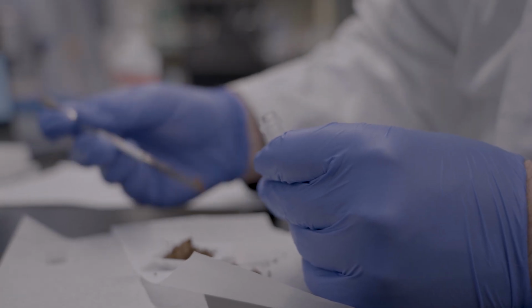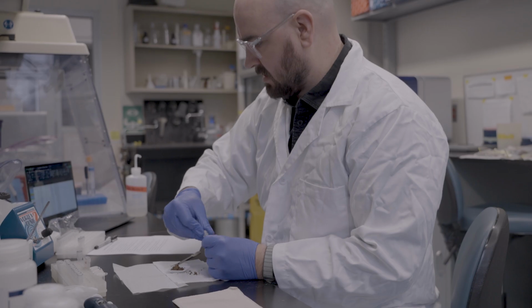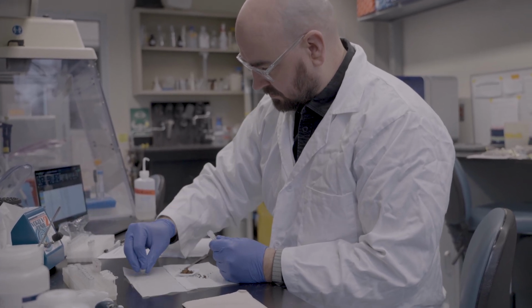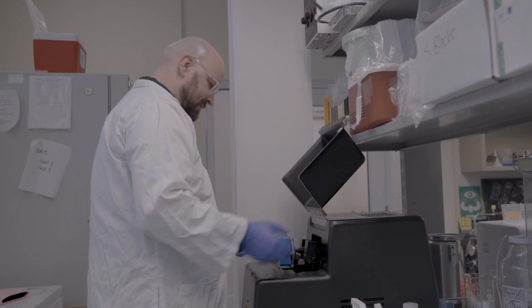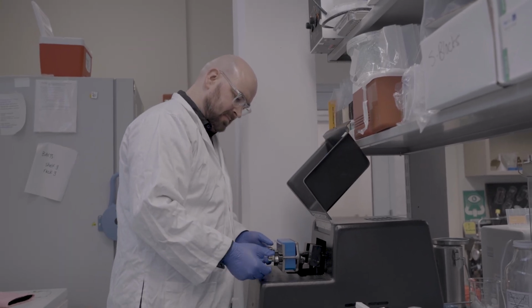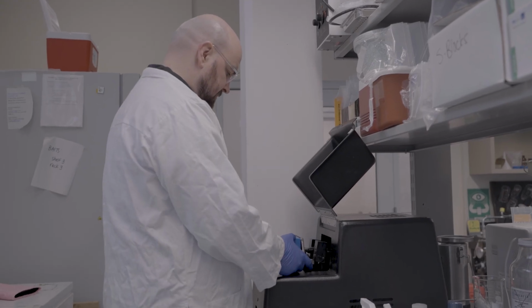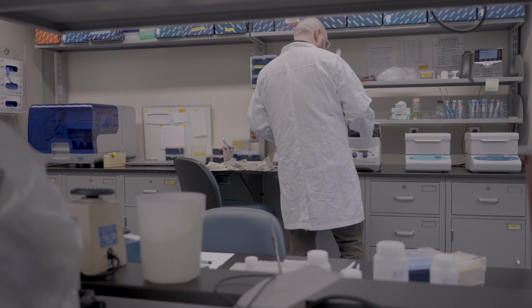And then once that extraction process is complete, I have a tube essentially of just that little piece of DNA and a little bit of liquid. We move over to the second part of our process, which is called PCR, and we amplify on an extreme level every DNA within that little tube. We expound that by thousands and millions.